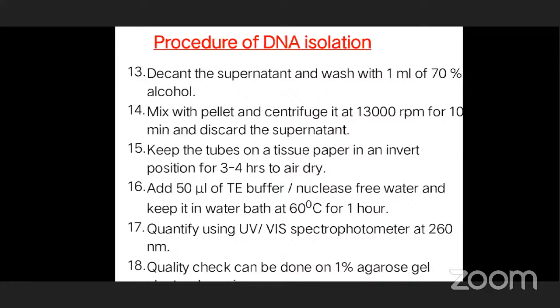Keep the tubes on tissue paper in an inverted position for 3 to 4 hours to air dry. By this process, the complete solution and alcohol are removed. Then add 50 microliters of tris EDTA buffer or nuclease-free water and keep in a water bath at 60 degrees centigrade for 1 hour.